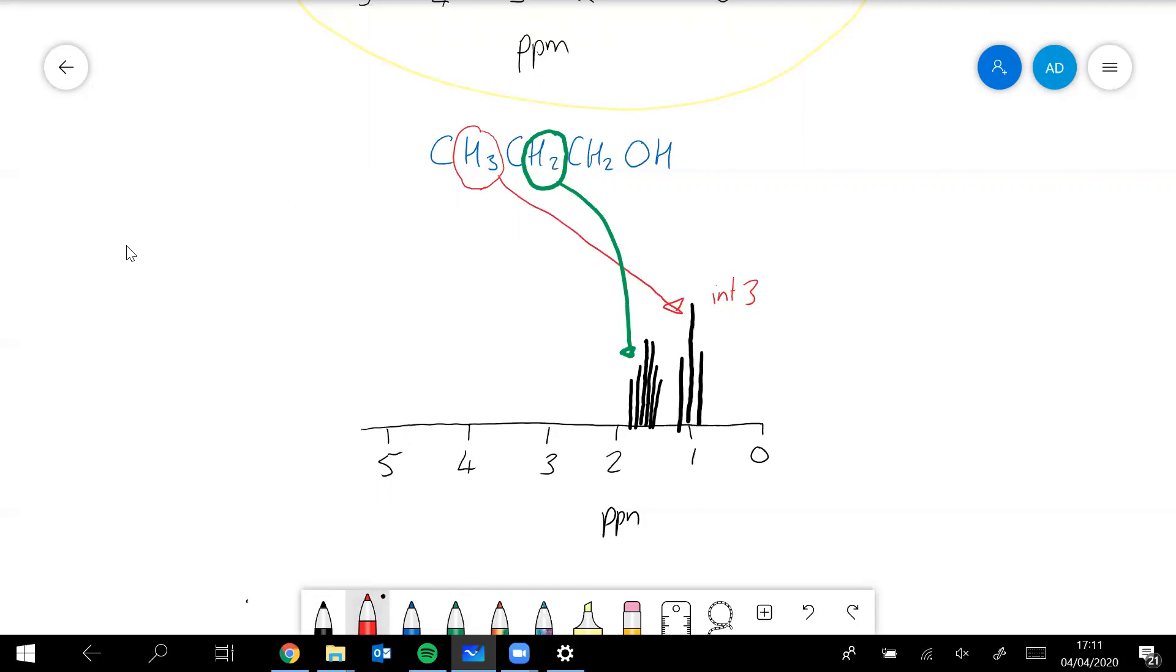Integrated value here of two. Let's just think about these ones now, these two. They are attached to a carbon which is attached to an oxygen, so the ppm is going to be quite high, it's going to be about four.